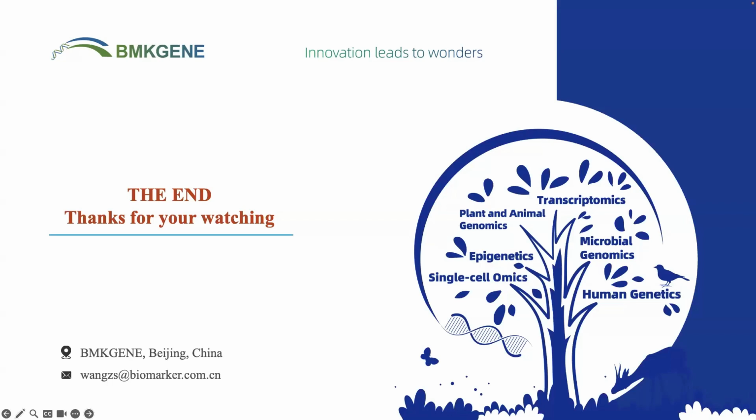The first question is, how many times can I adjust my visualization results? Oh, this is a good question. Maybe our customers are not sure how many times they can customize these pictures. Here, I want to tell you that you can customize or personalize your images without any limitation. You can change the image step by step, one by one, until they suit your needs well. So don't hesitate and try BMK Cloud now.